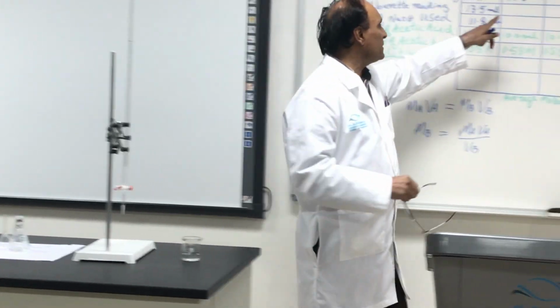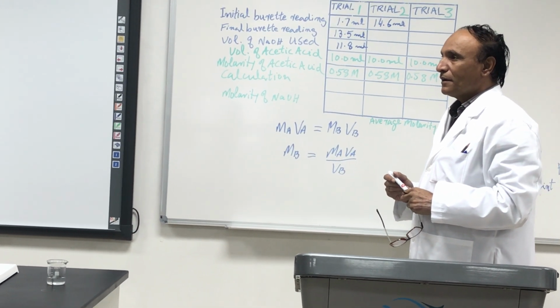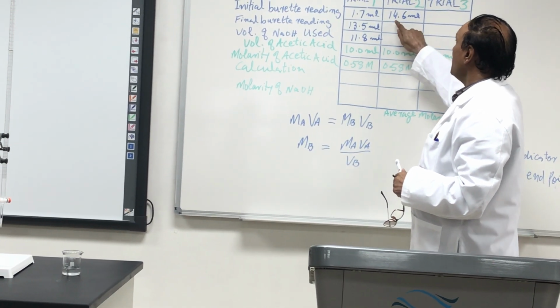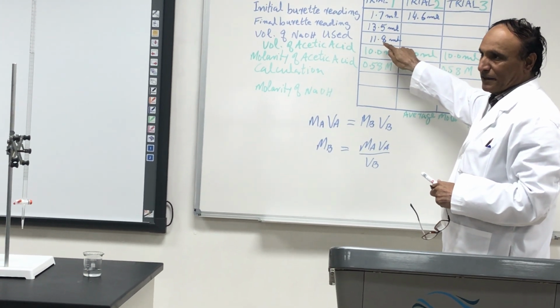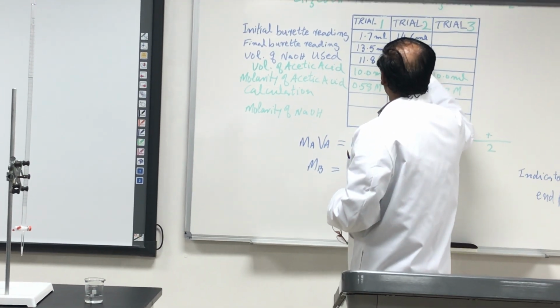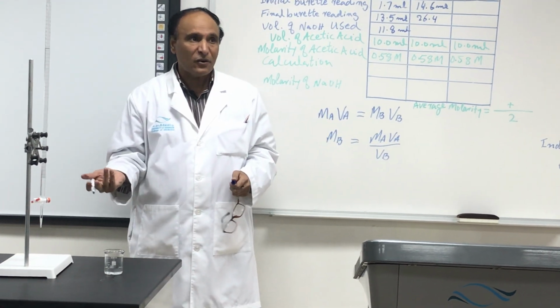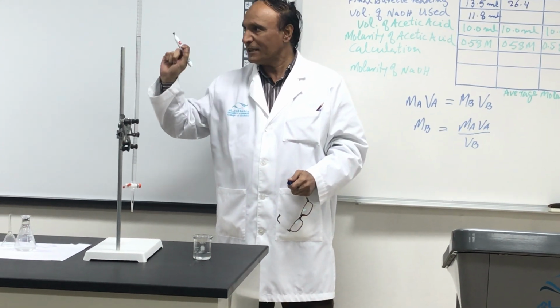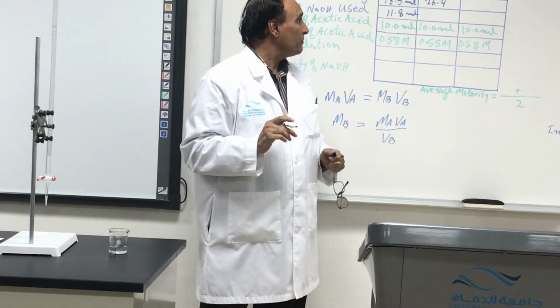Yeah, it is 14.6. And where will it finish? 14.6 plus 11.8 is 26.4. I am just writing it. Maybe our answer is not correct, because maybe my first reading is wrong. So I know that approximately it will be 26.4. Did you understand?